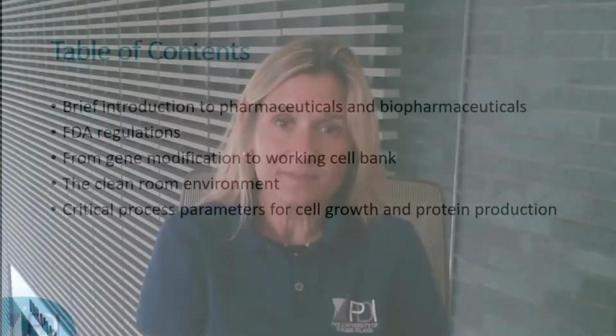This course will encompass not only upstream processing, but gene modification to working cell bank, how we get to that upstream process. Then I'll move you through scale up of cell culture, and finally harvesting of our biotherapeutic protein. I hope you enjoy.